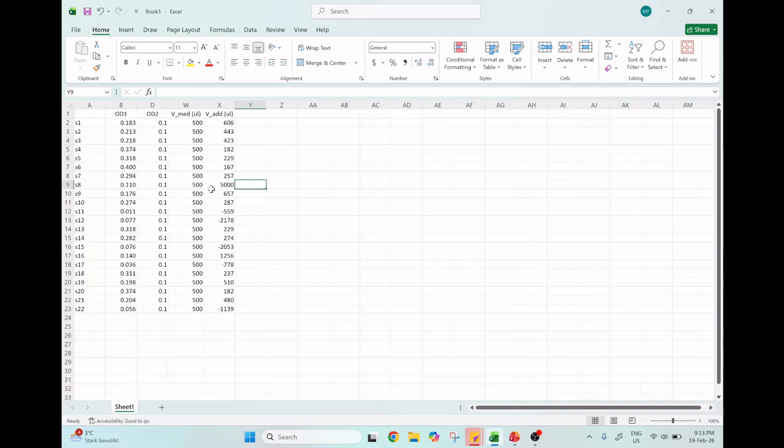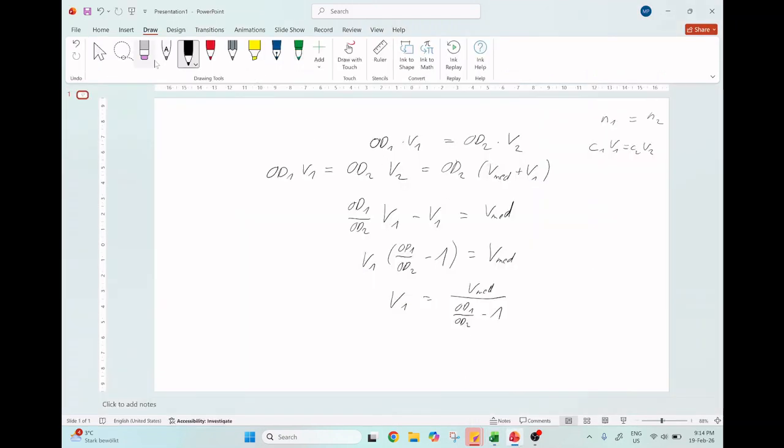And by doing it this way, you may need a lot more volume, which was not a problem in the classical case, because there, if your culture is essentially what you want, then you take pure culture without diluting it at all. Here, since we already have a certain volume in our tube, we will, by definition, dilute it, which means if it's very low to start with, then we have to take a lot of it to make up for the volume that's already in the tube. So how can we select this value here smartly? Let's get rid of everything.